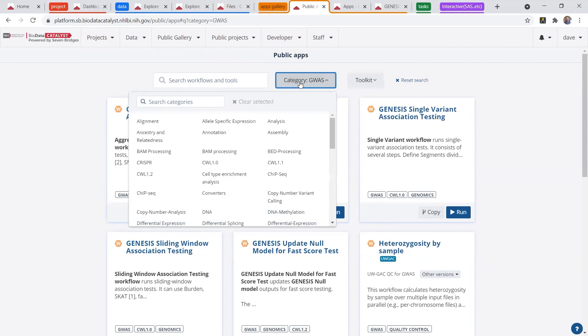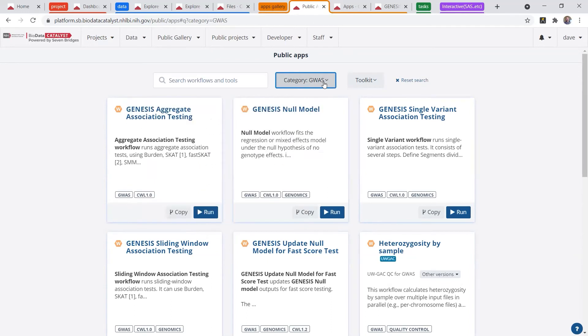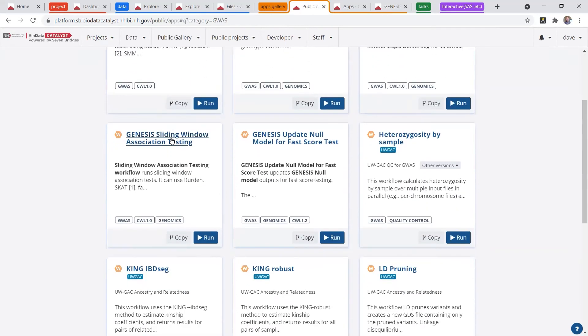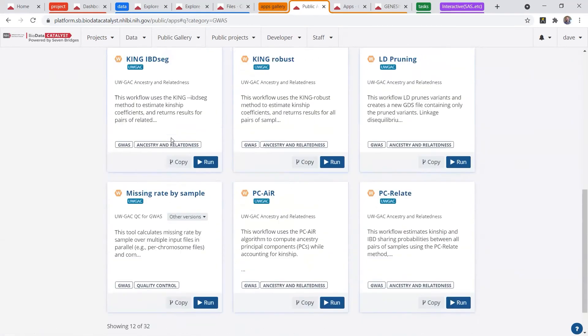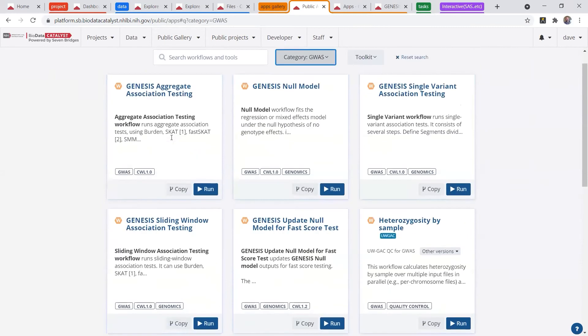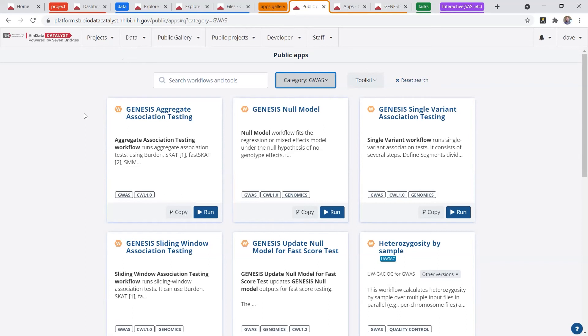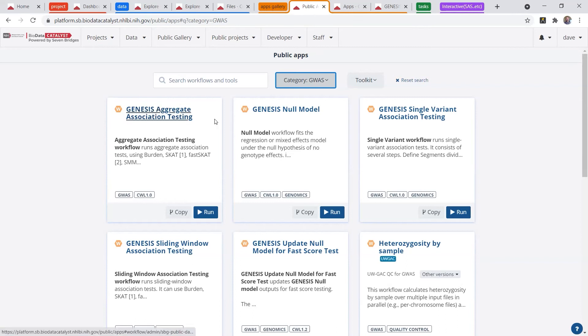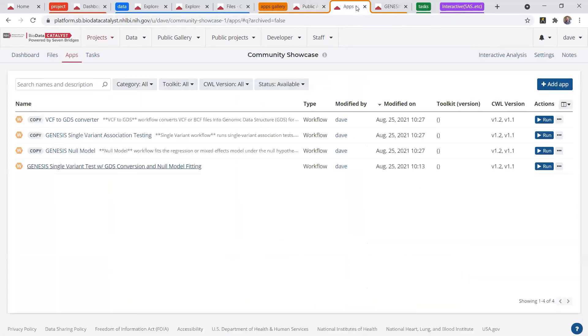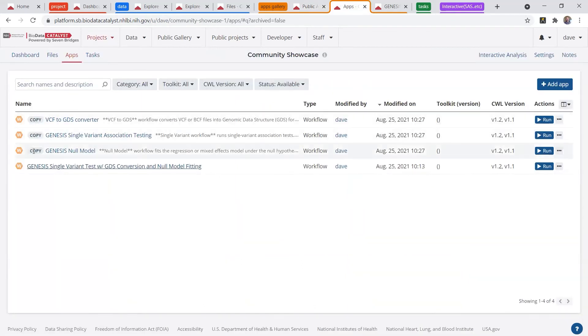So let's say we want to do a genome-wide association test today. I selected the GWAS category, and I have all these cards that are popping up. I can click on any of the cards, and it'll give me a description of what the tool does, how long it'll take to run, and how many cloud credits it should take based on the file input size. So I previously selected some tools to do a genome-wide association test, and I pointed them and linked them to the apps tab.